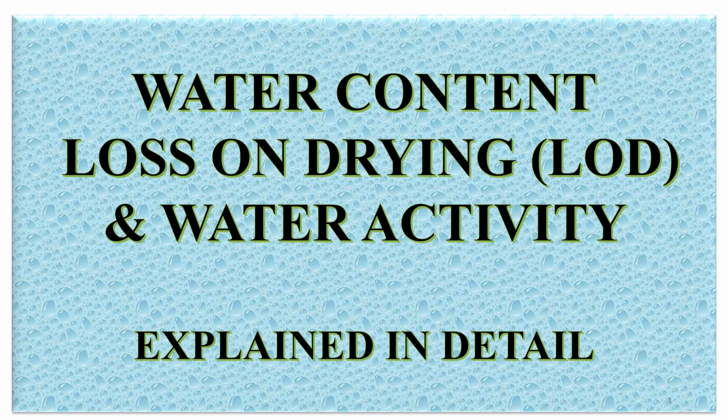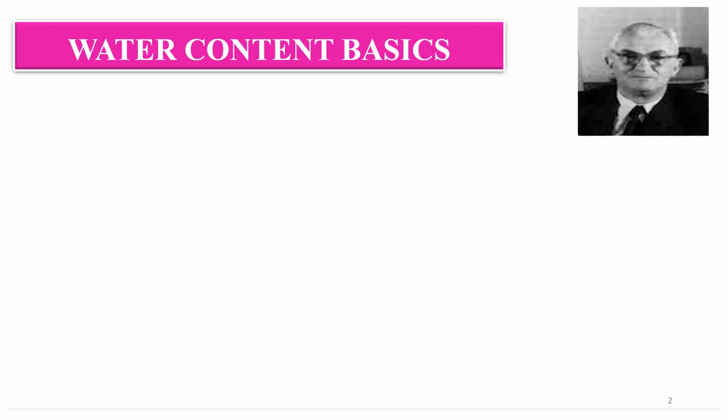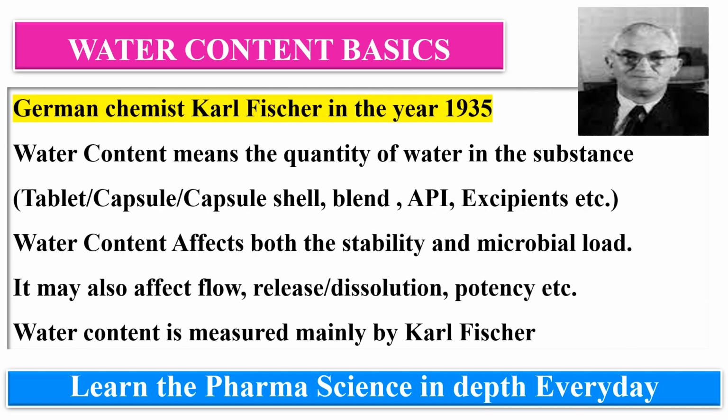Hello and welcome, dear learners, professionals and students, to the interesting topic on water content, loss on drying, that is LOD, and water activity. In this video we are going to discuss these three basic terminologies and what the differences are between water content, loss on drying and water activity. So we will first see the water content basics.